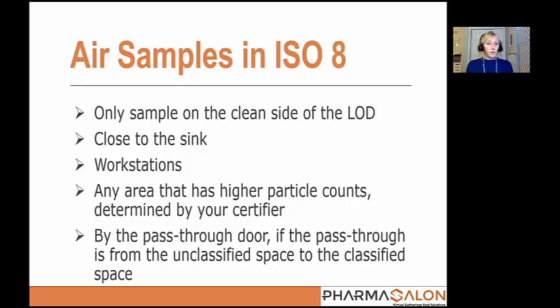So the last thing that we want to take a look at is where your pass-through doors are. If you have a pass-through that is going to go from the unclassified to the classified space, we want to make sure that that gets included within the sampling plan.